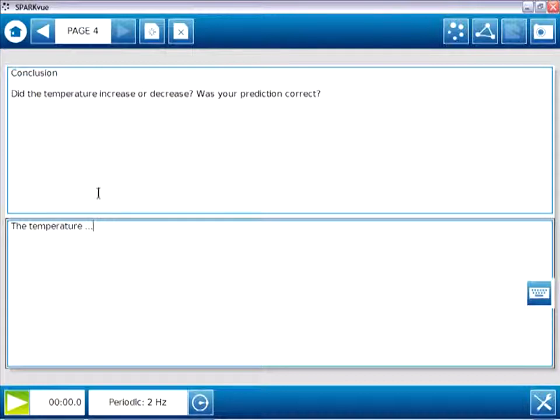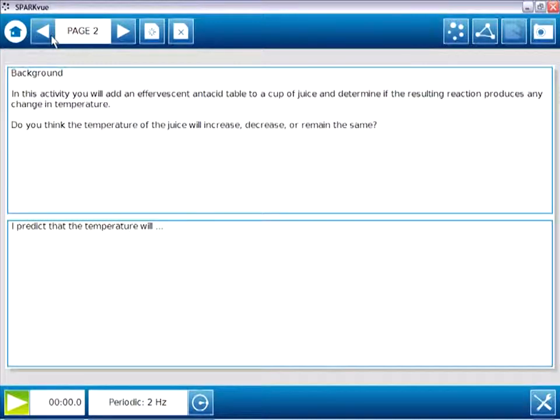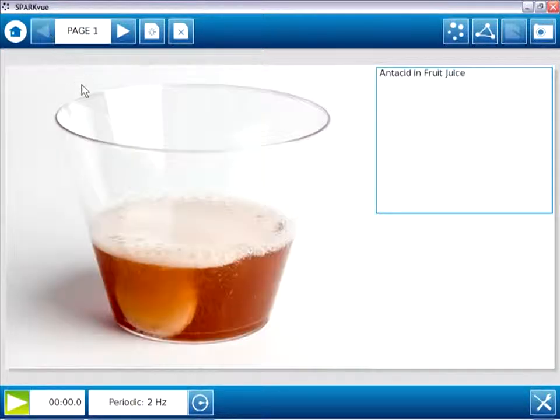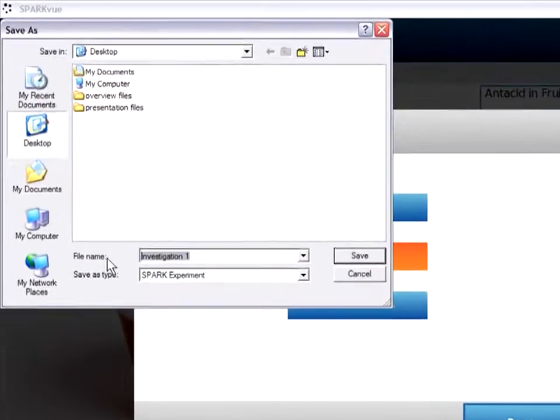Okay. Now let me page back through, just visually scanning these pages to make sure they look okay. I didn't miss anything, and they look like they're okay. So what I'd like to do now is save this file as it currently is. So I'll go to the sharing button in the upper right, choose to save this file as, and I'll give it a descriptive name.